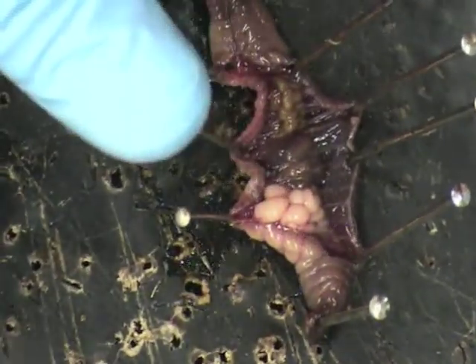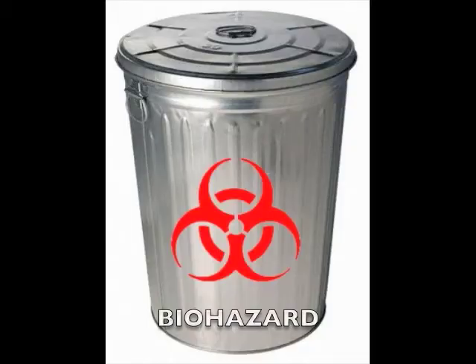After you have observed and identified the organs, dispose of your earthworm in the proper trash.